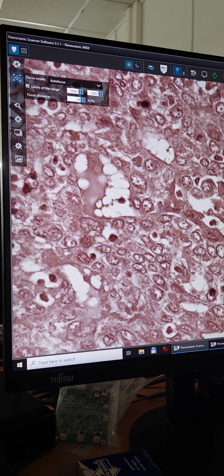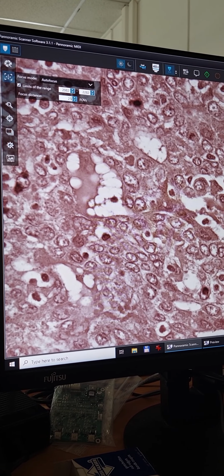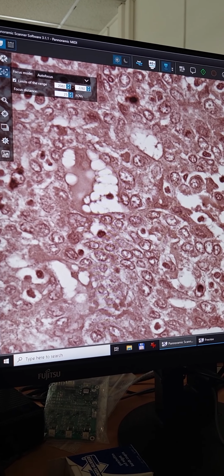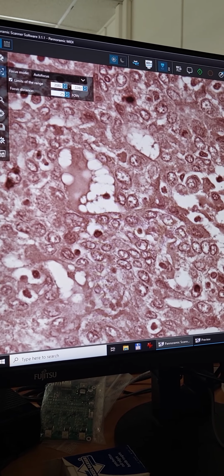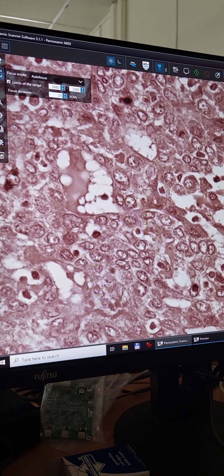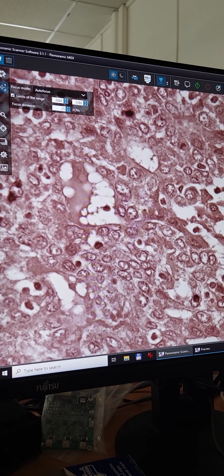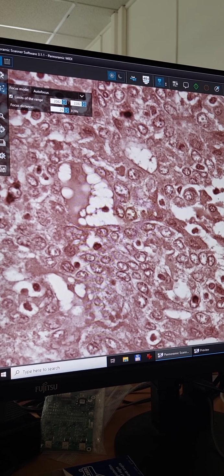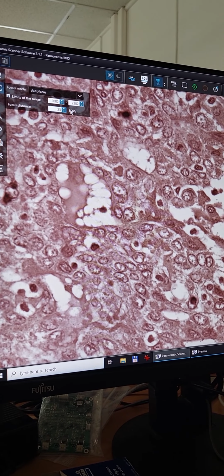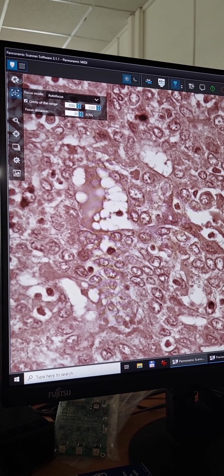You have a few points, and if they are not in the same Z position, of course, because your sample is like this, the scanned focal plane is going to be like this. So it is like a sheet on these points, and the final scan is going to use this sheet and in XY, the red area, to finally do the image grabbing. So that's it. That's the autofocusing method. In our case, 20 is going to be perfect.